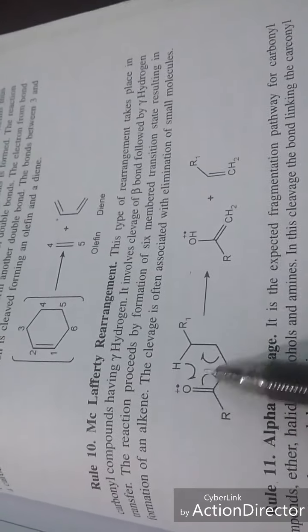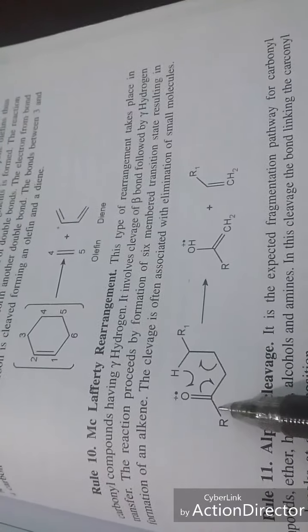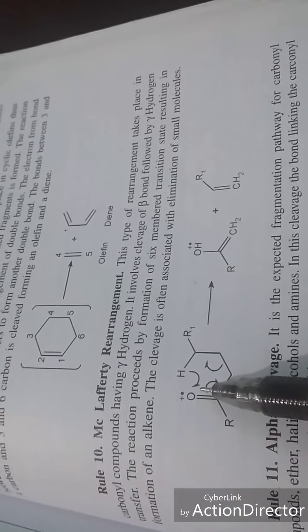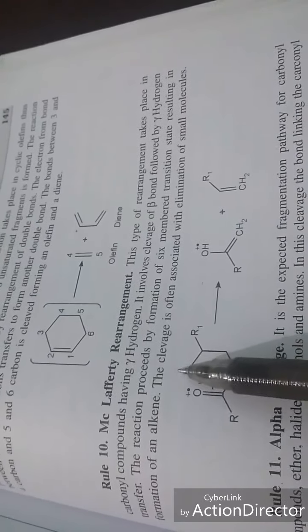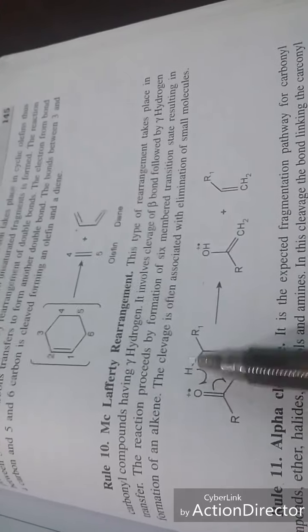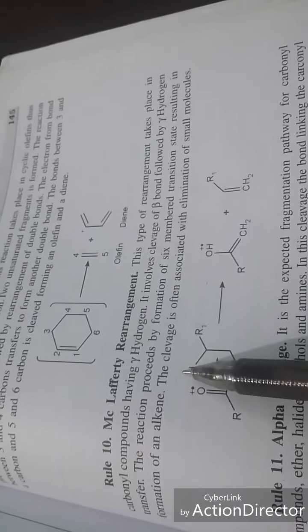Next rule is the McLafferty rearrangement. This type of rearrangement takes place generally in carbonyl compounds which have a gamma hydrogen. So if this is the functional group, this will be alpha, this is beta, and this hydrogen is the gamma hydrogen. It involves cleavage of the beta bond followed by gamma hydrogen abstraction.